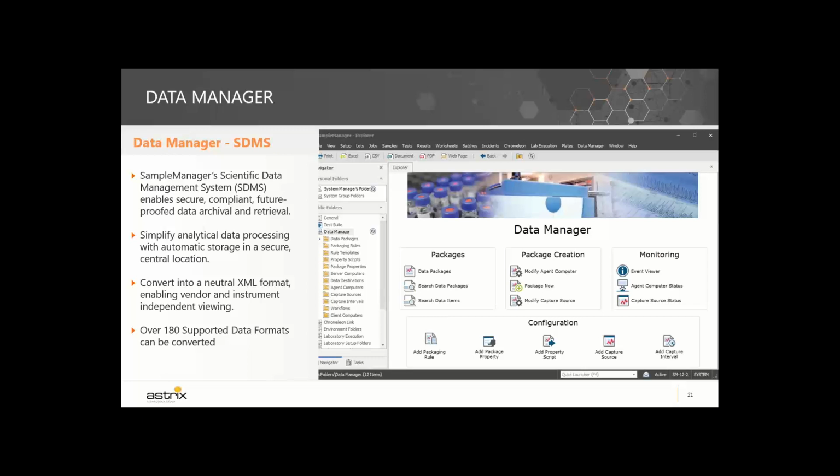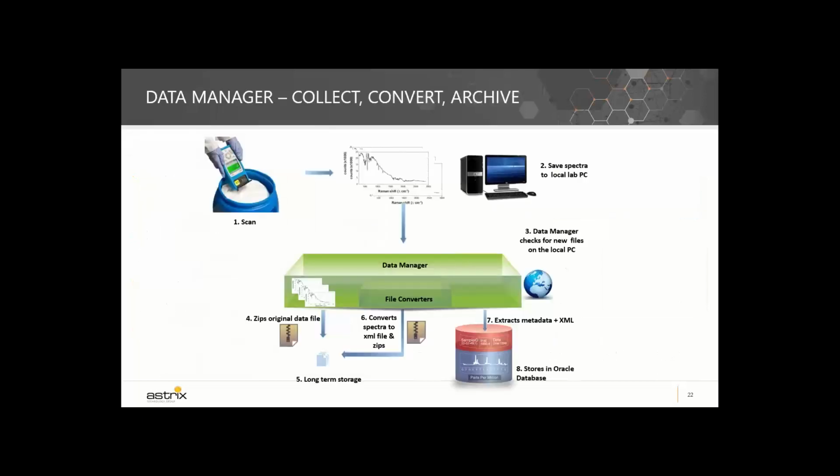That means that for those instruments, these data converters are going to be able to parse the metadata of the raw data that's being read, and store that into tables to be able to be searched, etc. If you have an instrument that's not part of these 180 supported data formats, it's a different data format, you can still use Data Manager to store the data into an XML format and at least archive that data into a unique place. And the concept here is really for long-term storage.